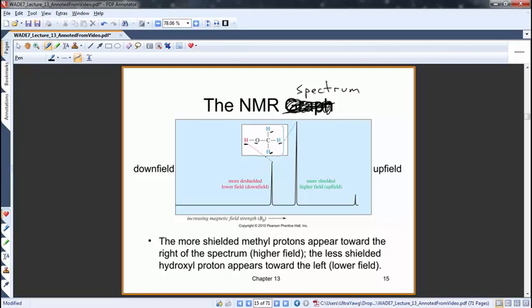So if I was this hydrogen, I would say, I'm a hydrogen that's bonded to a carbon of methanol. If I was this guy, I would say, I'm a hydrogen that's bonded to a carbon that's part of methanol. That's the exact same thing. That's all the same words. And so these are all the same as each other.